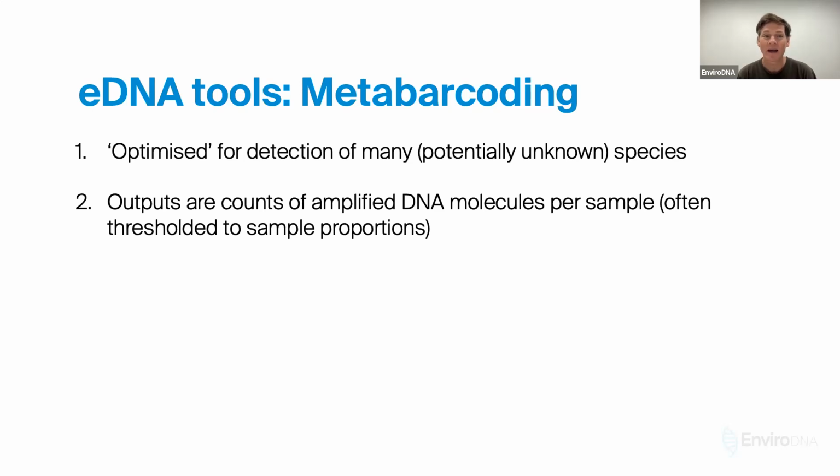It's very different to have 1 million reads for something than it is to have 100, and the proportions are obviously going to scale with the total read depth. So there's information both in the number of read counts you get. We know this has partial correlation with the amount of DNA in the inputs, which itself, in some circumstances, can have partial correlation with the abundance of the organism. But there are, of course, a huge number of caveats to that, and a large body of research showing when that works and when that doesn't.